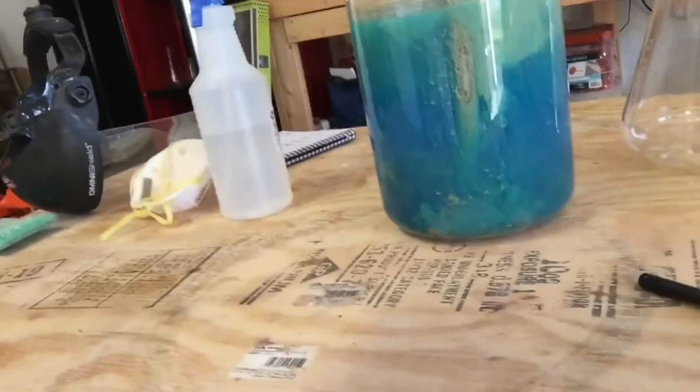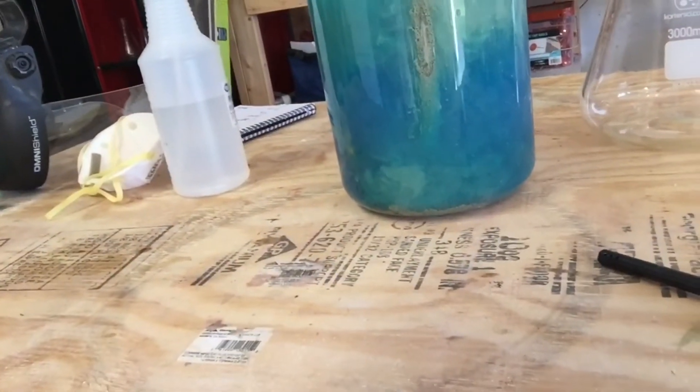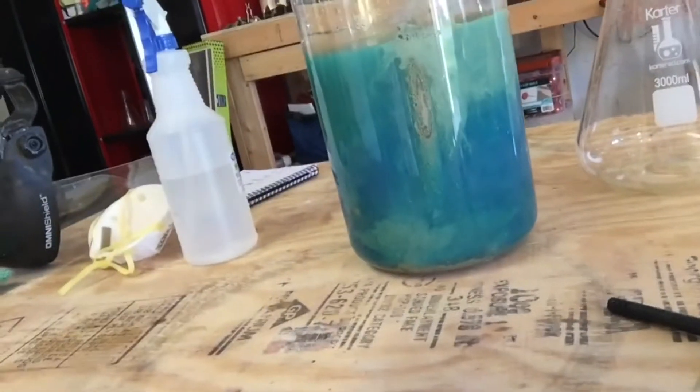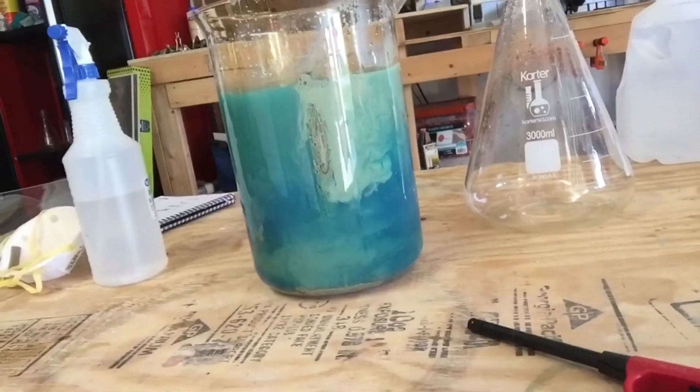As you can see, that reaction starts happening immediately. You can see the silver forming and it's crystallizing onto the bottom, and the copper should be going into solution. We're going to let this sit for a few days. I'm going to keep it in the fume hood because this is also going to be producing some fumes, and I'll come back in a few days.